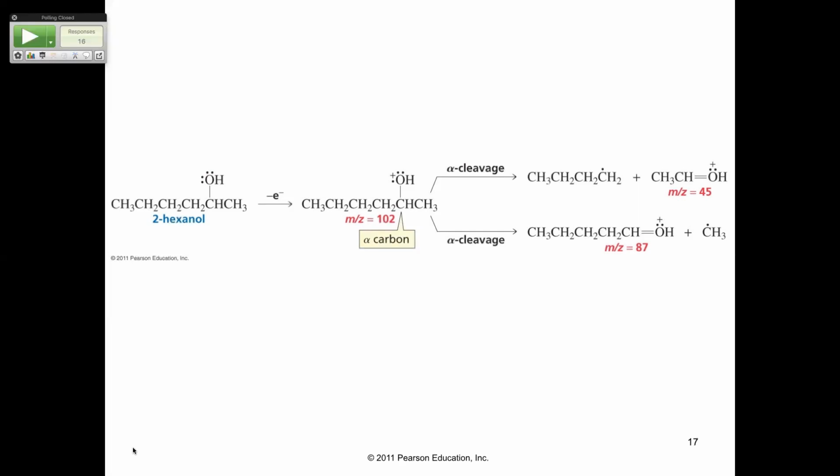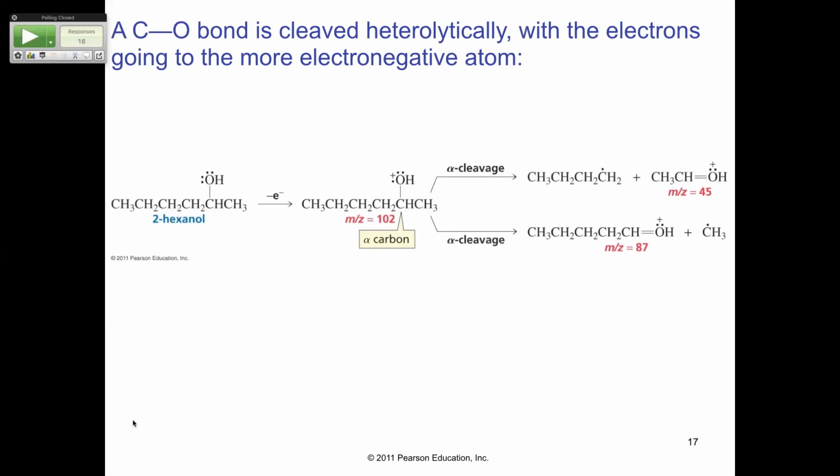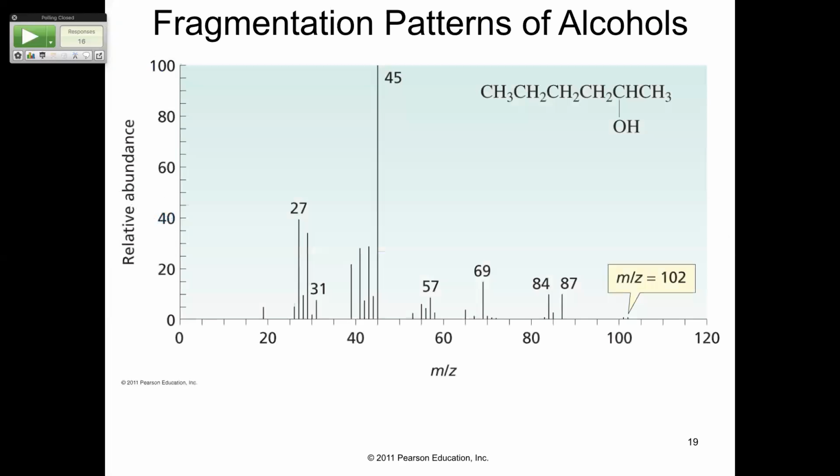Okay, and again, the oxygen on the alcohol is going to stabilize stuff. Do I not have a spectrum with this? On the next slide it is? Yeah, here we go. Okay, so look how little your base peak is, your molecular ion peak is, sorry. It's really little because it loses water so readily.